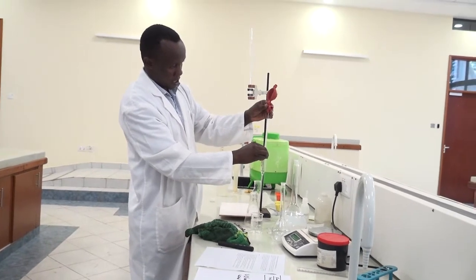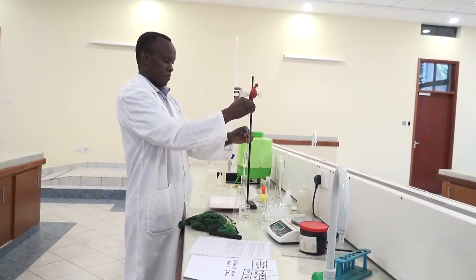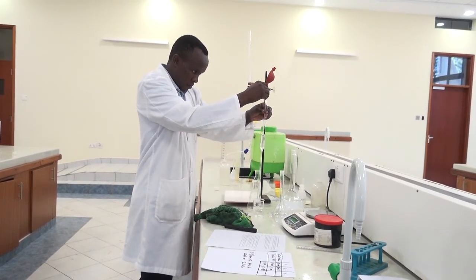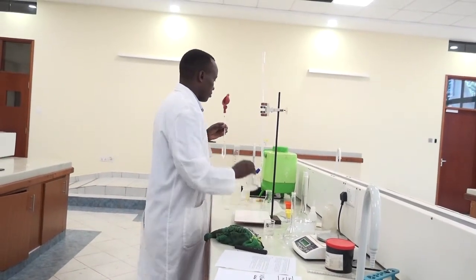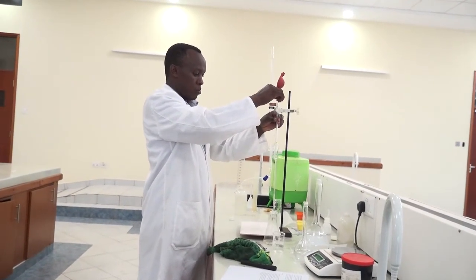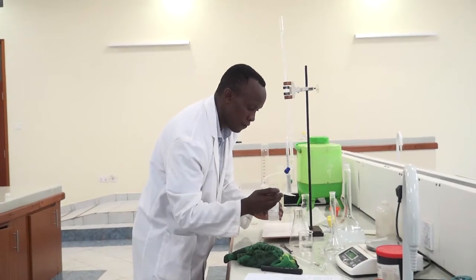25 ml of it. 25 mils of the sodium hydroxide, transfer it to the conical flask. Now I'm going to do my last titration. Here I add my phenolphthalein indicator, still 2 drops of it.